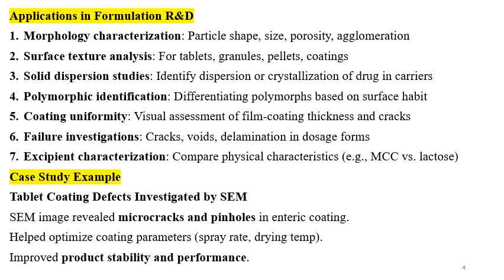Applications in the formulation R&D. So now this slide will provide you the information regarding application and uses. Why can SEM be used in the formulation R&D? As we know, the particle shape, size or porosity, crystallization or visual appearance, there may be some cracks in the particles or formulations which may affect the quality attributes, and that's why the SEM technique is used.